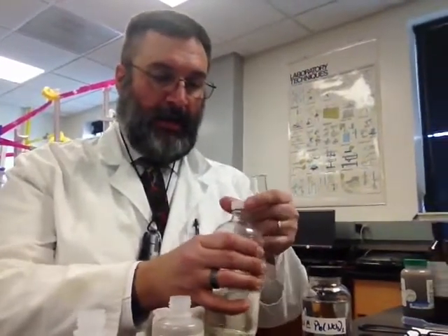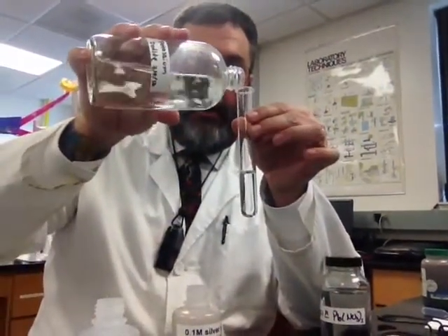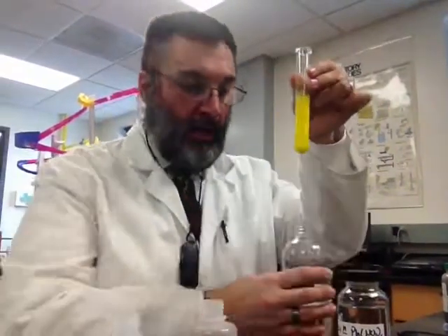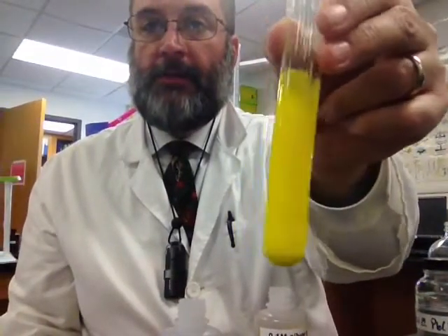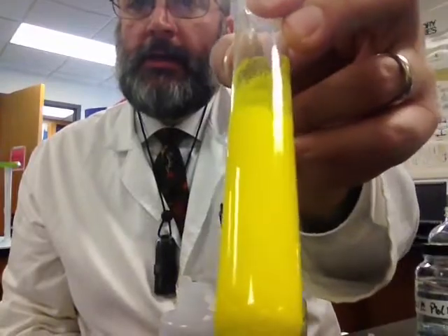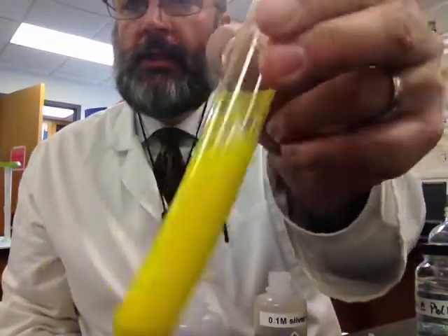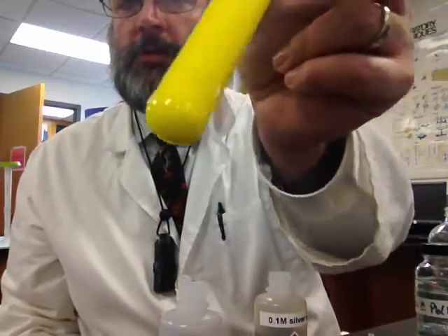So potassium iodide added to lead. Now this one happens kind of fast, so you're going to want to watch carefully, okay? Boom. Right away. Okay? Look at that. There's your observations. That's a very different color. Look at what's going on around the top of that solution. Do you see that stuff stuck to the walls? All right? That's a solid. There's a solid compound formed. You can see some of it at the bottom of the tube.